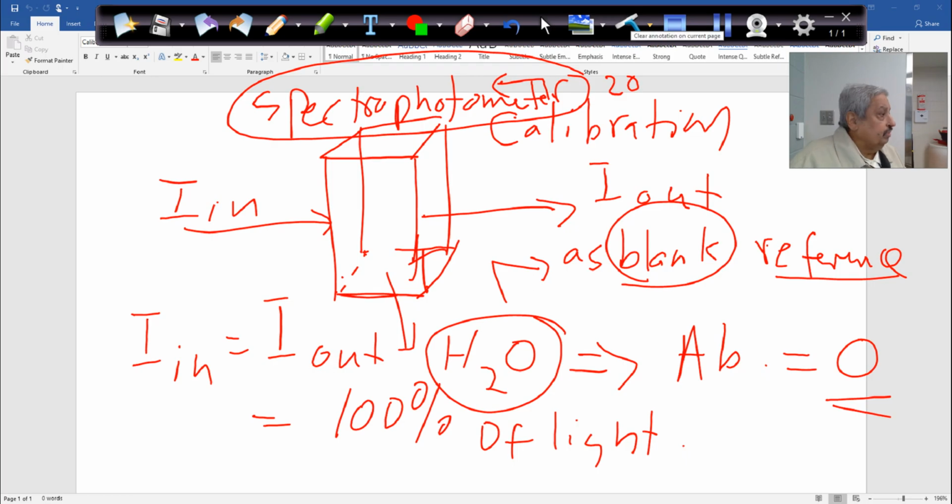Can I take this one out? That's a very bulky instrument we don't use anymore. This is a very fancy, small, tiny one, rather than the old one. So 20, 30 years ago, even here about 10 years ago, we were using the bulky one, which is still good, but it's more mechanical. It does not have any digital software, so everything you have to do by hand.